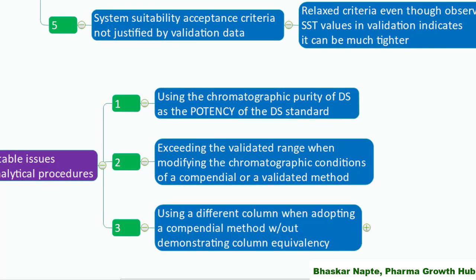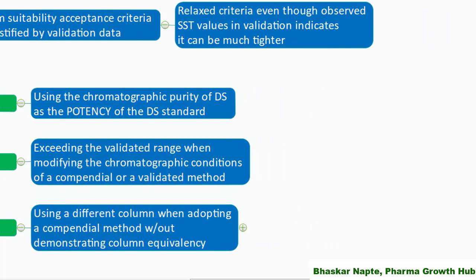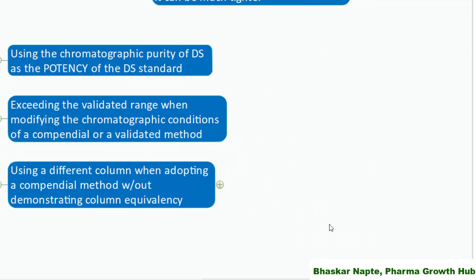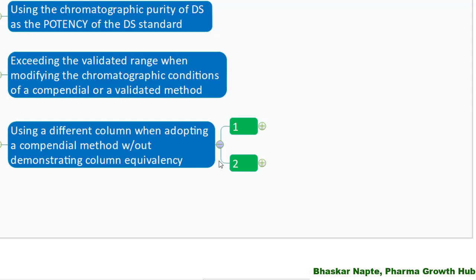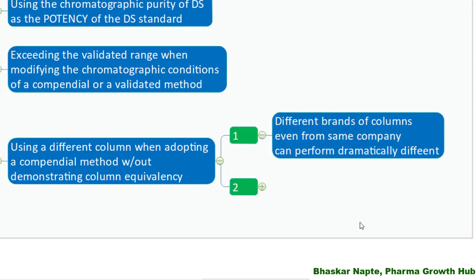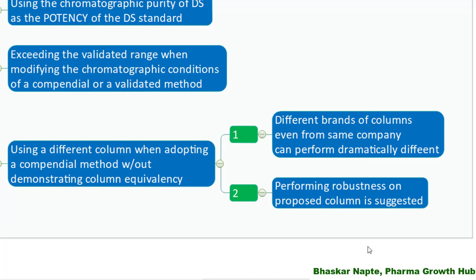Using a different column when adopting a compendial method without demonstrating column equivalency. Column equivalency is very important — without proving it, you cannot use an equivalent column. Different brands of columns, even from the same company, can perform dramatically differently. It is very important to prove that your proposed column performs equally well compared to the original column. Performing a robustness study on the proposed column is suggested.